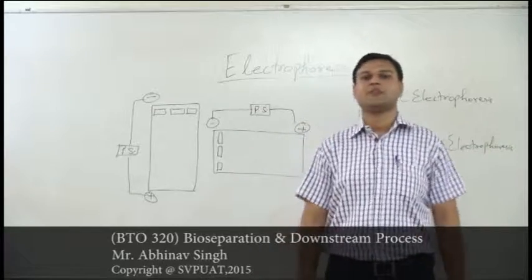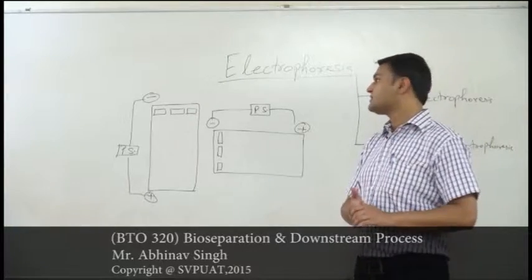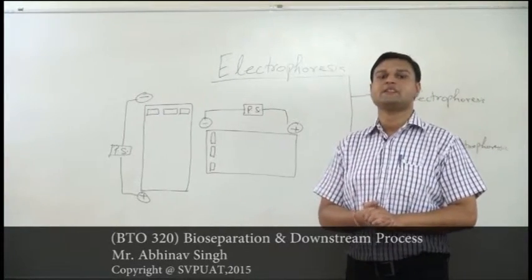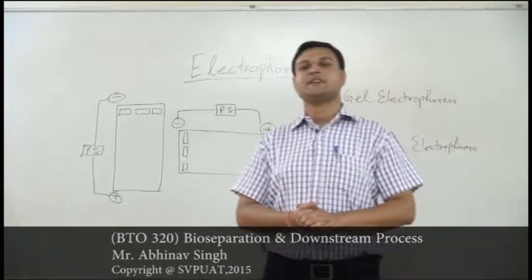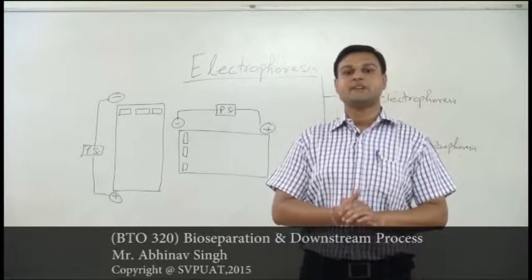Hello class, today we are going to start with our topic, that is electrophoresis. Electrophoresis is an advanced separation technique that is widely used in laboratories as well as for commercial practices for the separation of particles. Which kind of particles will be separated?